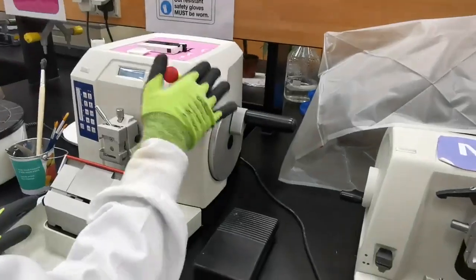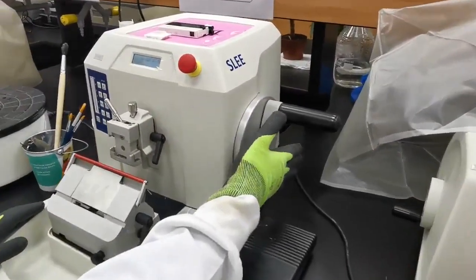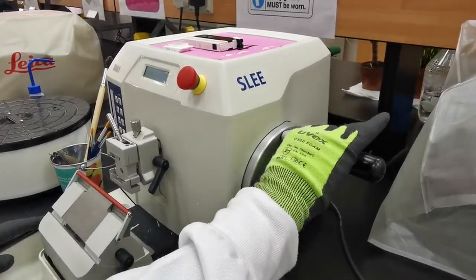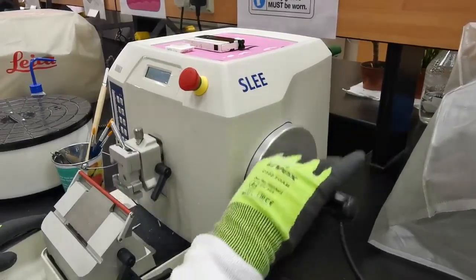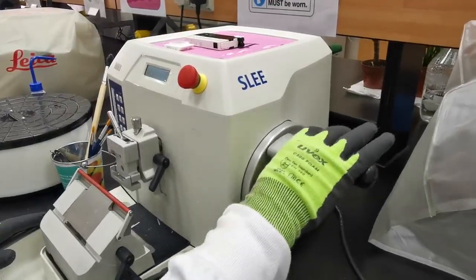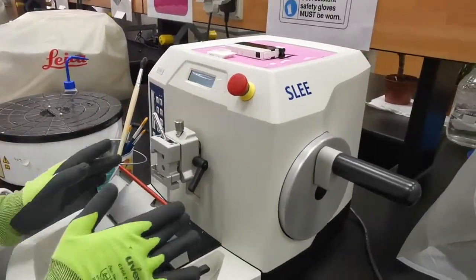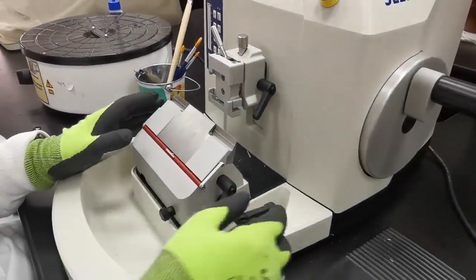This automated microtome has the same wheel, and the wheel is equipped with a locking mechanism for safety. Right now it's unlocked and it can move — you can use it as a usual manual rotary microtome. Now it's locked, so it won't be moving. The knife stage works on the same principle as the manual one.